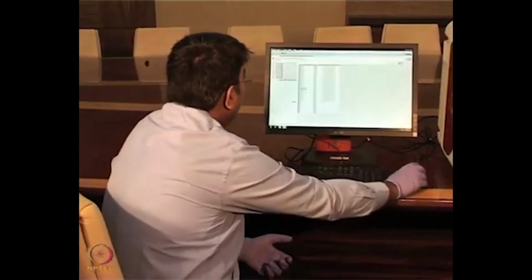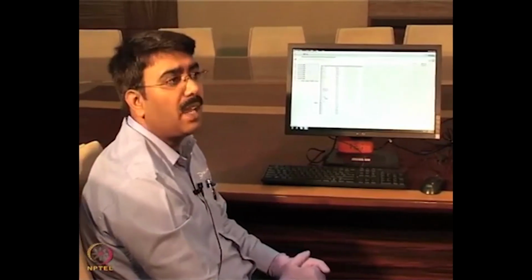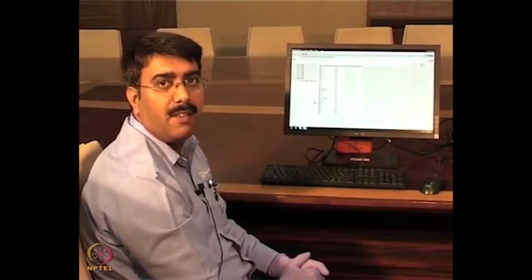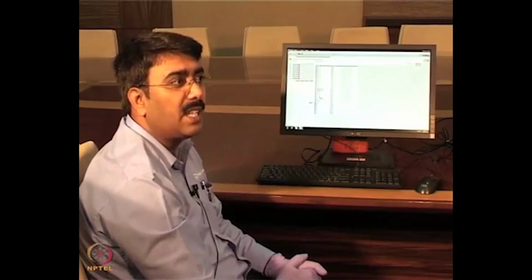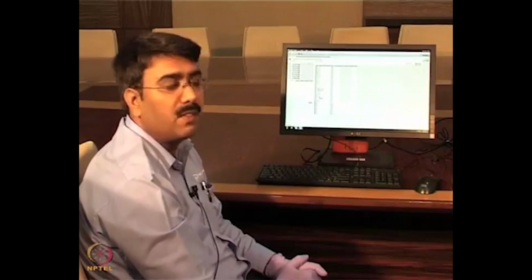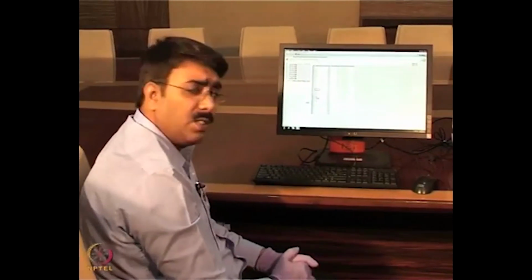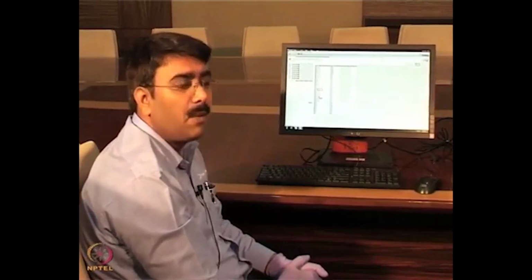Here, as I mentioned, the buffer can be any kind of buffer. In this experiment I am using a PBS buffer with an additive, 0.1% BSA, as well as a surfactant, 0.02% Tween 20. This composition is in PBS at pH 7.2.